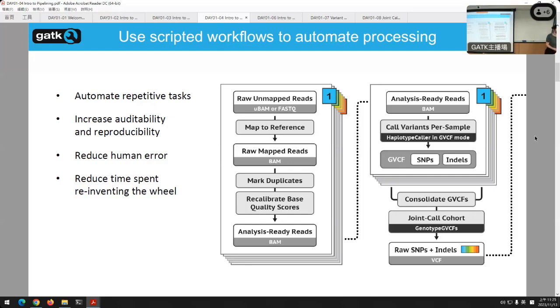But that tends to take longer, because maybe you were getting your coffee when the tool finished, and so you didn't see, and it took an extra 10 minutes for you to start the next tool. That could also be error prone. So you now have 3 different opportunities to supply the wrong input file, for example, because you're launching 3 different tools. And you're now spending a lot of your time monitoring these tools and launching the next step in the process.